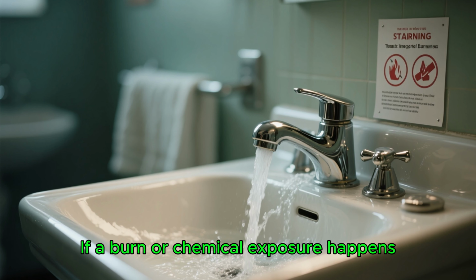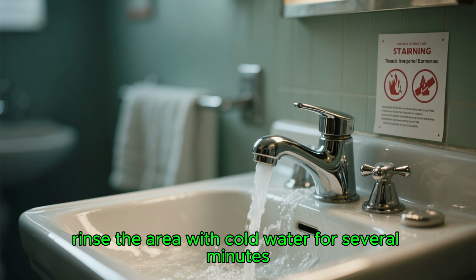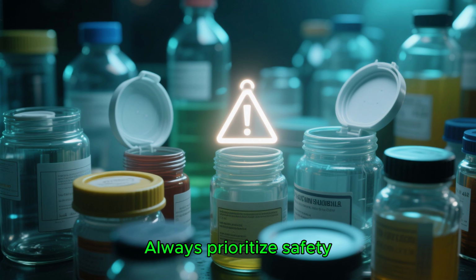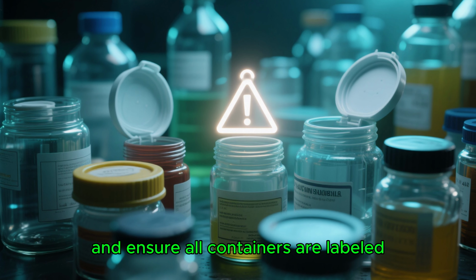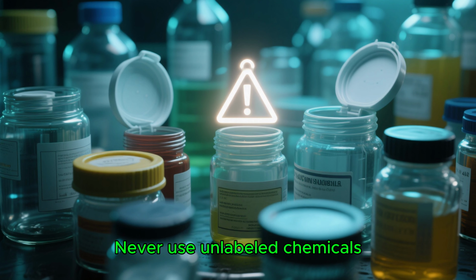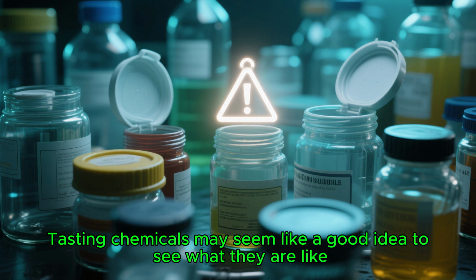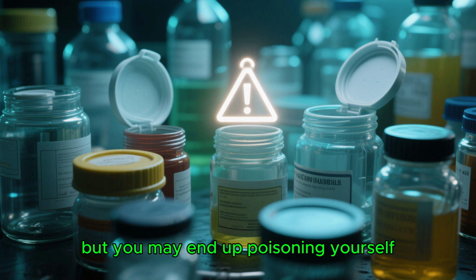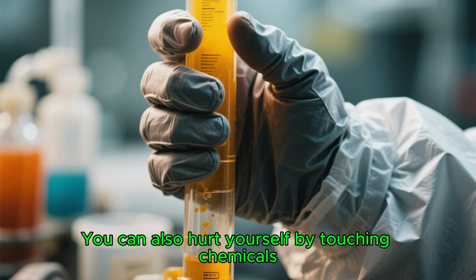If a burn or chemical exposure happens, rinse the area with cold water for several minutes. Always prioritize safety. Never leave chemical containers open and ensure all containers are labeled. Never use unlabeled chemicals. You should always remember this rule. Tasting chemicals may seem like a good idea to see what they are like, but you may end up poisoning yourself. You can also hurt yourself by touching chemicals.